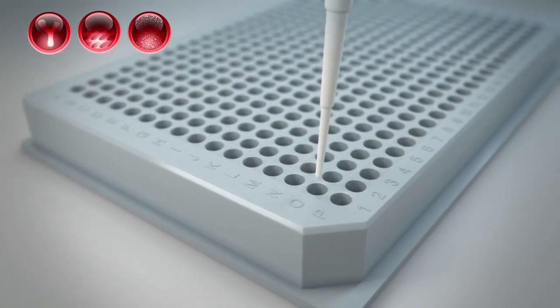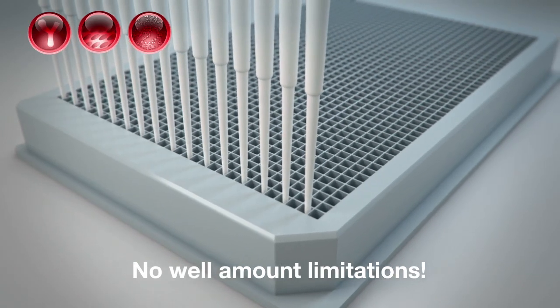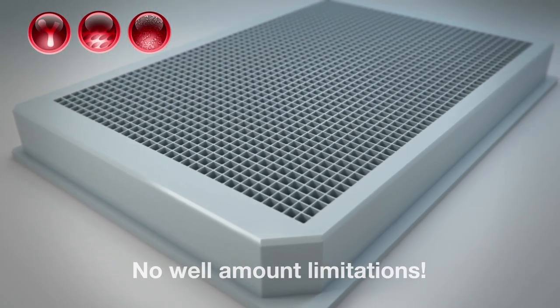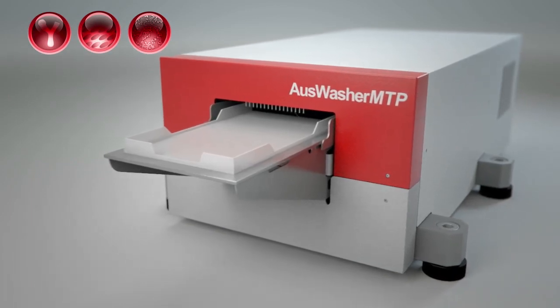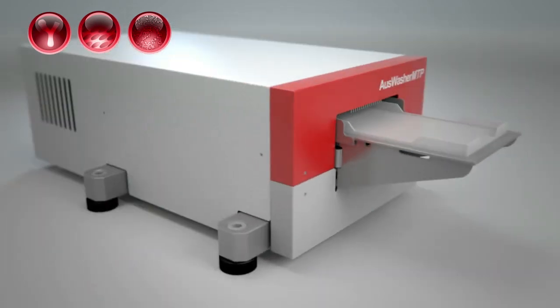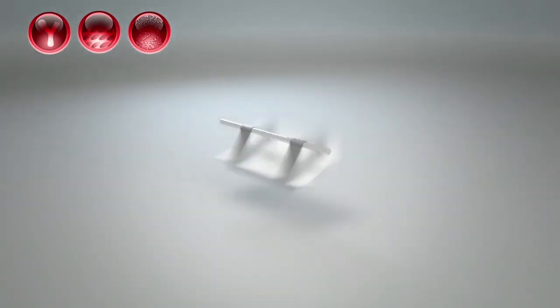Unlike conventional washers, where the time to aspirate wash buffer increases with the number of wells in a plate, Oz Washer empties 96, 384, or even 1536 well plates in the same incredibly fast time.